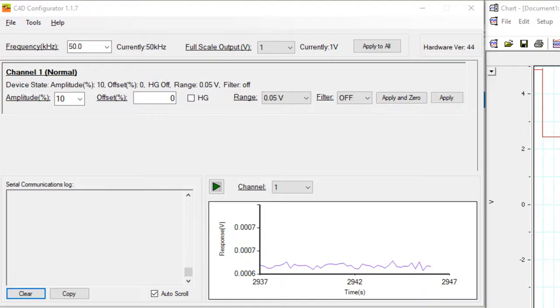When you open the software, it should look something like this. I have a single channel ER815 connected at the moment.